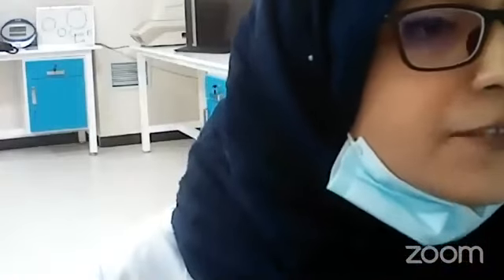We are not using conventional PCR for COVID-19 testing. We are using RT-PCR. This is the answer to your question about needing the COVID-19 protocol for conventional PCR.